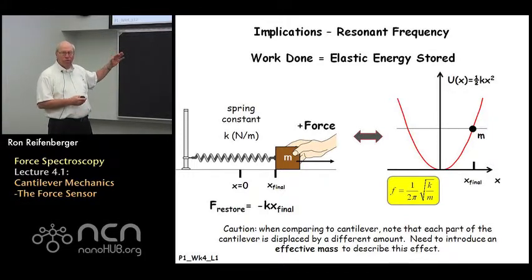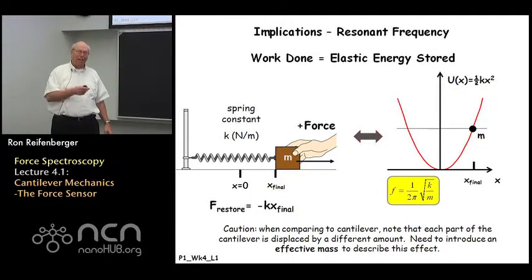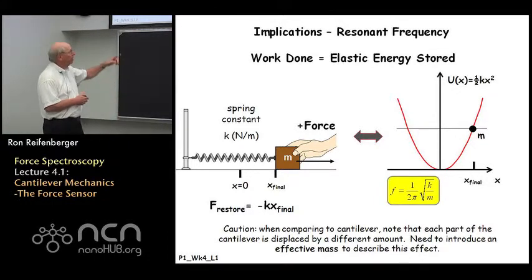You'll recall from your introductory course in physics that if you've got a mass suspended on a spring and you stretch that spring and you let the mass loose, the mass will oscillate back and forth, and it'll have a characteristic frequency associated with that oscillation that's just related to the square root of the spring constant K divided by the mass M that's been displaced.